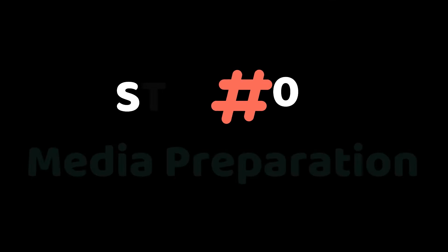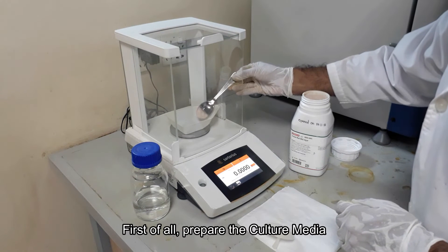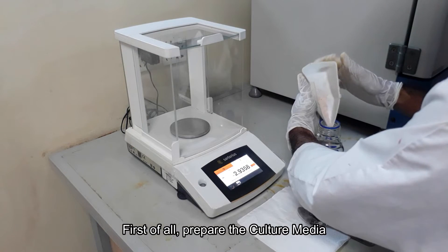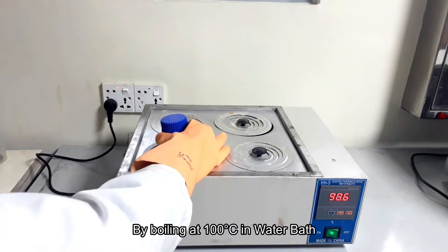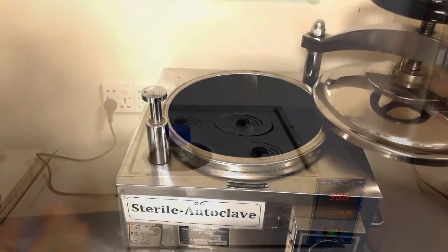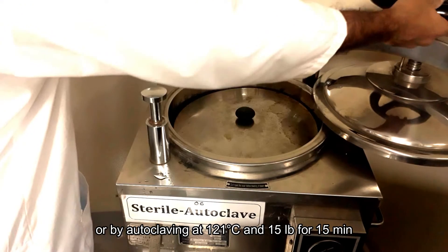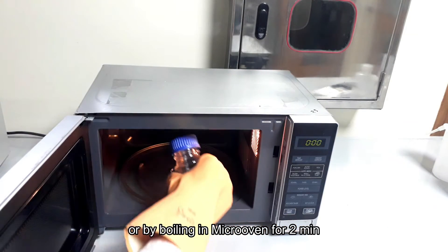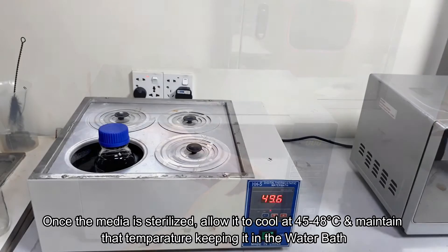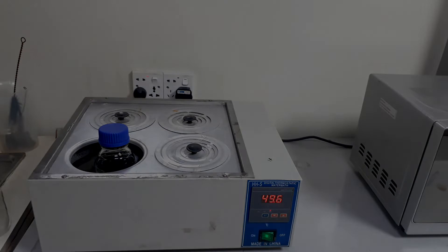Let's begin with the culture media preparation. Take the weight of agar media and mix with distilled water following the label on the media container. For sterilization, some media need to just boil to dissolve the media content. Some need autoclaving at 121 degrees Celsius and 15 pounds for 15 minutes. Others need to boil in a microwave oven for 2 minutes. After sterilization, the media is cooled to 45 to 48 degrees Celsius in a water bath.